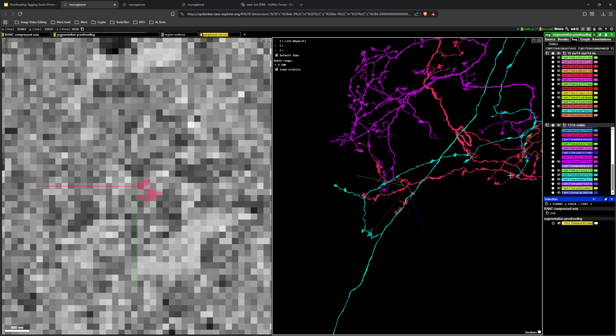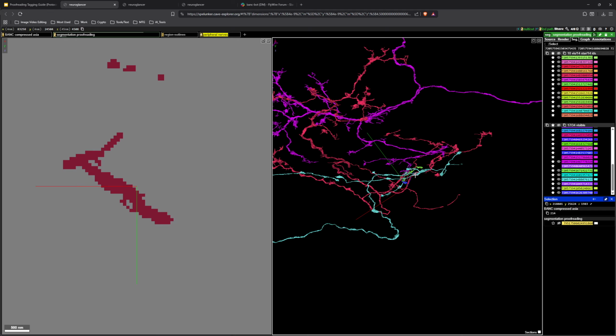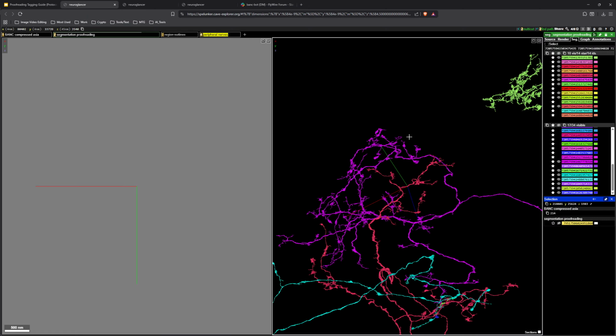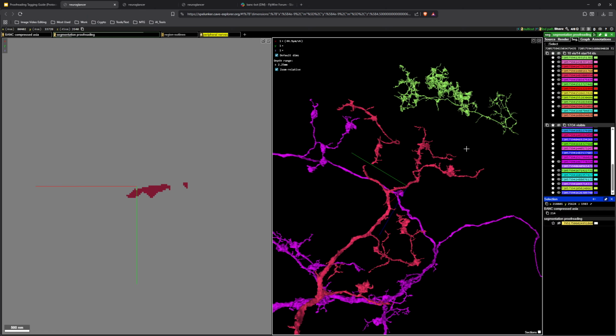And when you have finished, yes, it is still technically a ripped area, but this is also important. So this highlights why the ripped areas are being tagged as backbone proofread now, because when y'all do this, you're essentially finding everything that can be found.